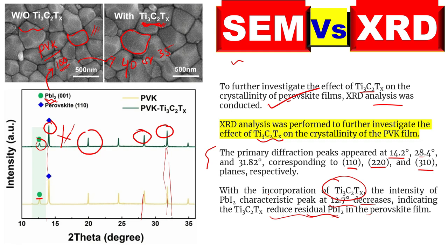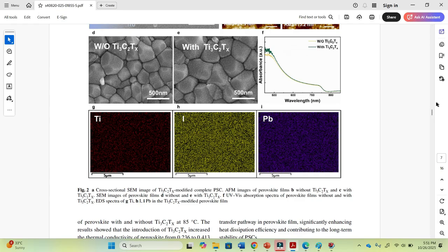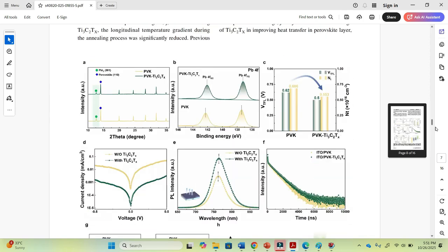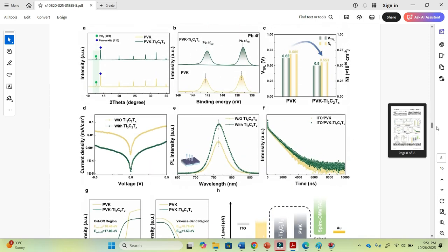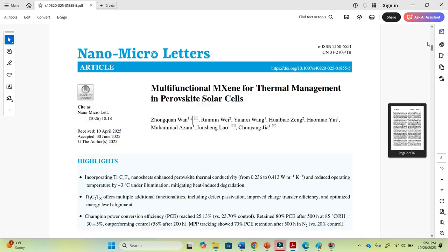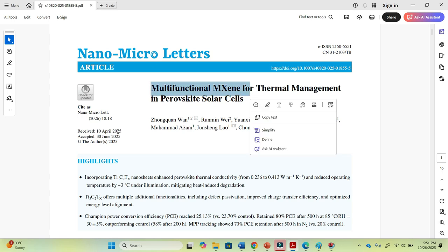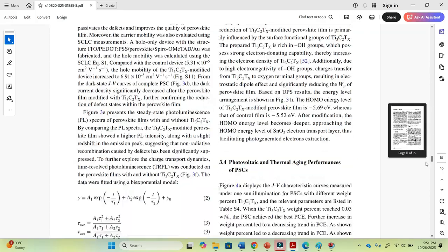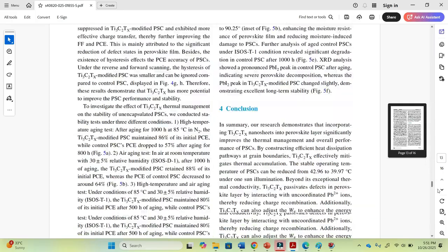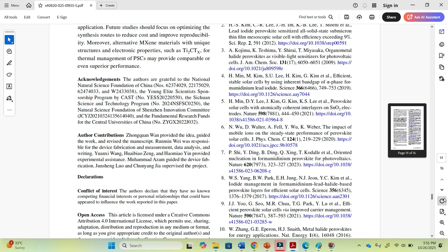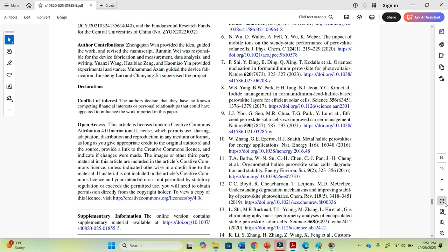The data was taken from SEM images and XRD graphs published in Nano Microlator, titled by one author in 2025. This paper is published under a Creative Commons license, version 4.0.